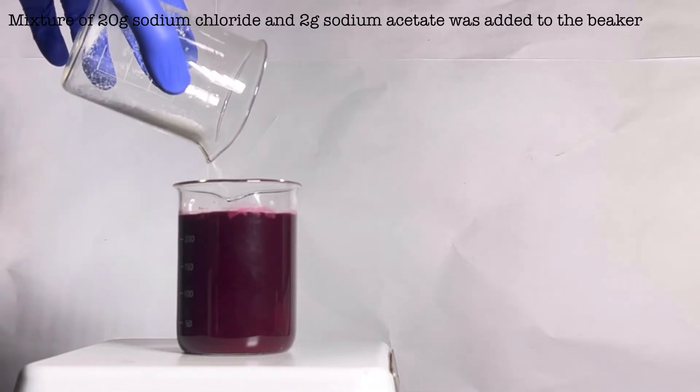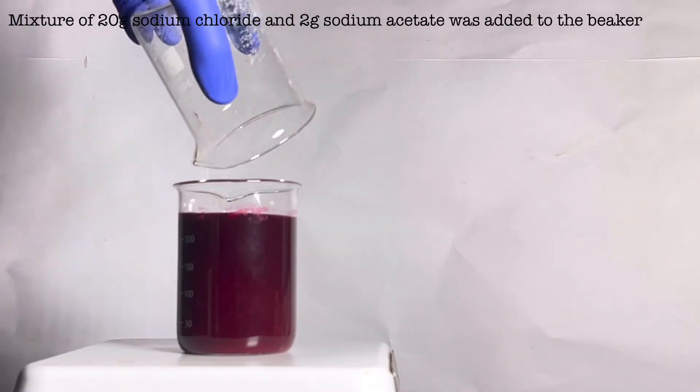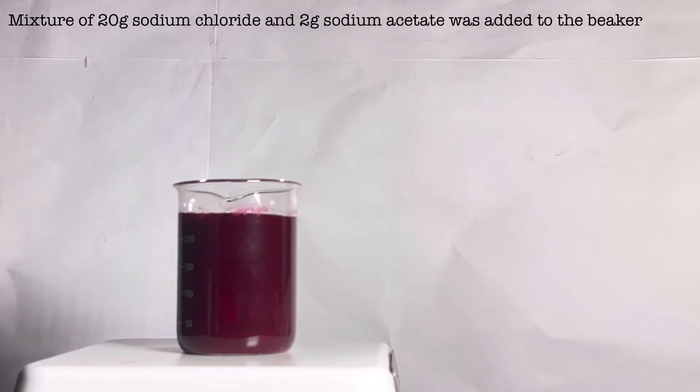A mixture of 20 grams of sodium chloride and 2 grams of sodium acetate was added to the solution. A lot of sodium violurate precipitates out immediately due to the common ion effect.